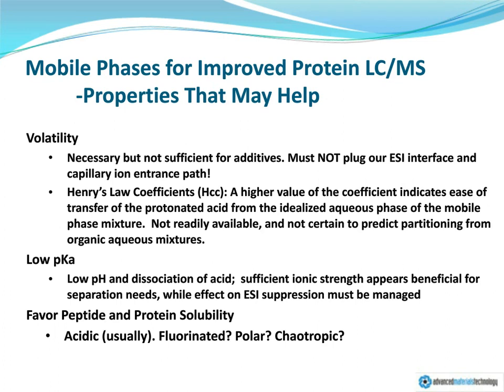We are doing electrospray ionization. Anything that we spray into the electrospray interface is going to end up in our mass spectrometer ion path. If it is not volatile, we will cause considerable problems with online detection. And, of course, keeping our mass spectrometer clean.